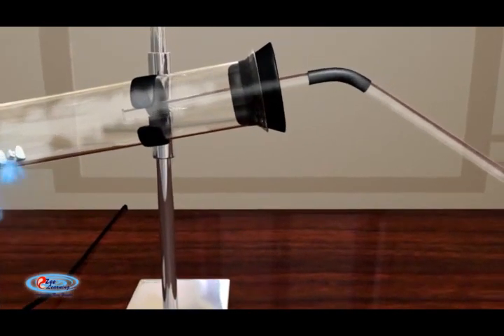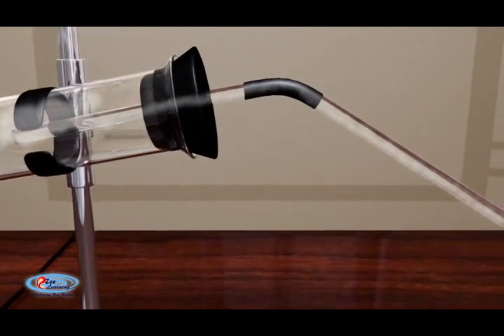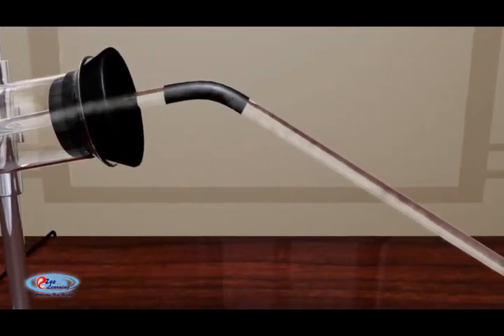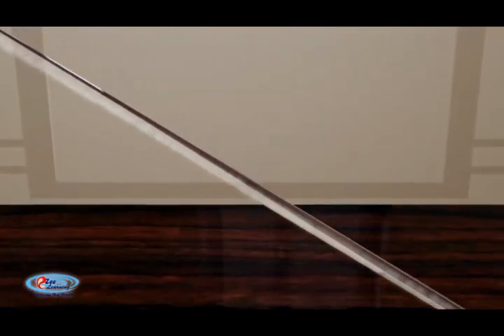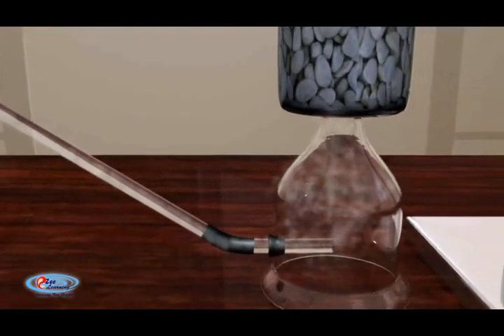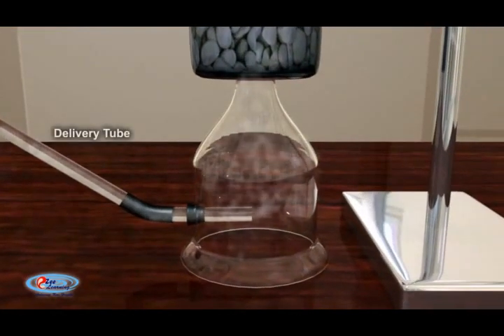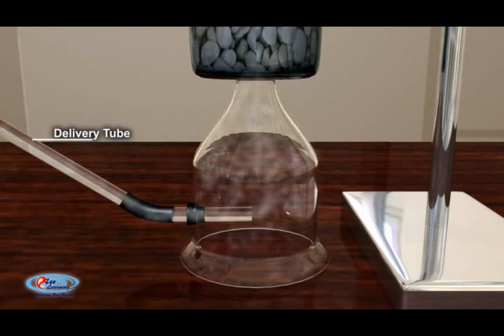We can easily observe that the mixture of ammonium chloride and calcium hydroxide transfers into a delivery tube. The calcium oxide will absorb the water produced in the reaction and ensure that the ammonia gas is dry.